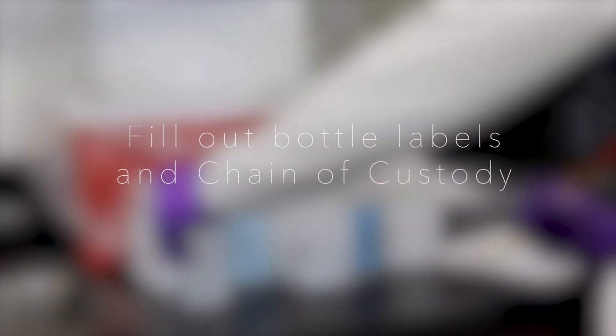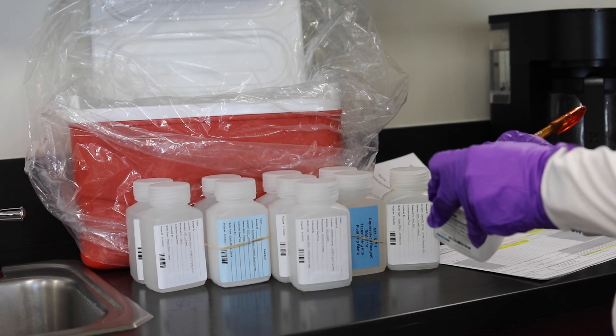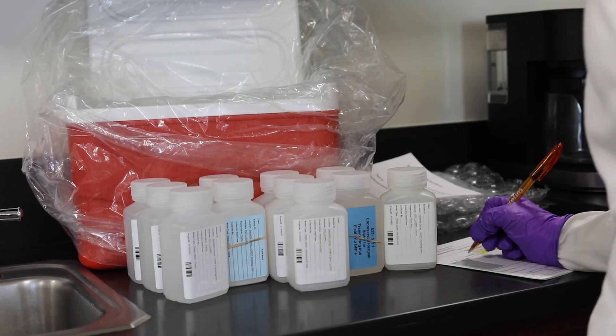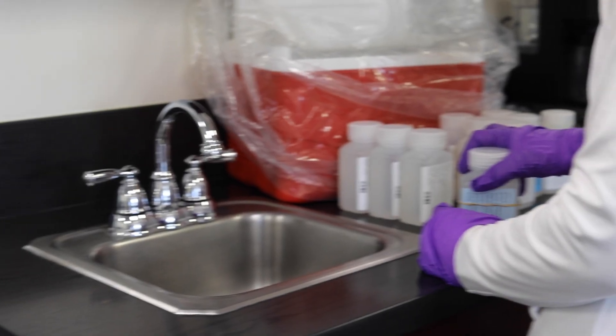Take a moment to indicate the sampling date, time, and site on the bottle labels and the enclosed chain of custody form. Please do not use a permanent or felt tip marker during this step. Information on the COC and the labels must match to be complete.